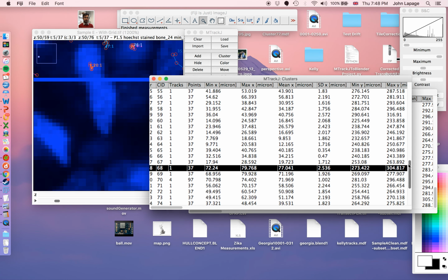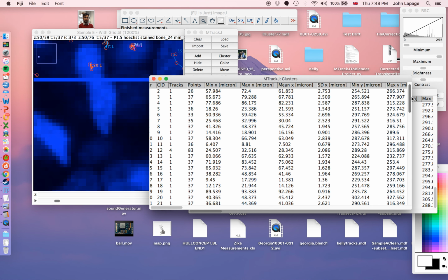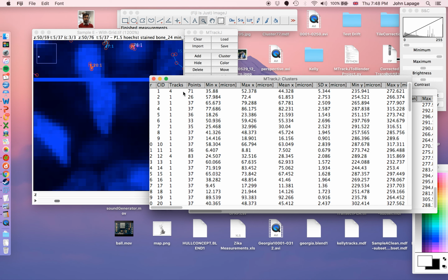It's worth checking your own curated submission, just to make sure that you've done it all perfectly. Otherwise you might miss out some points, and it might cause some problems down the line. So I hope you'll do that, and hope this helps you understand how to use these coordinates to find clusters in the image.